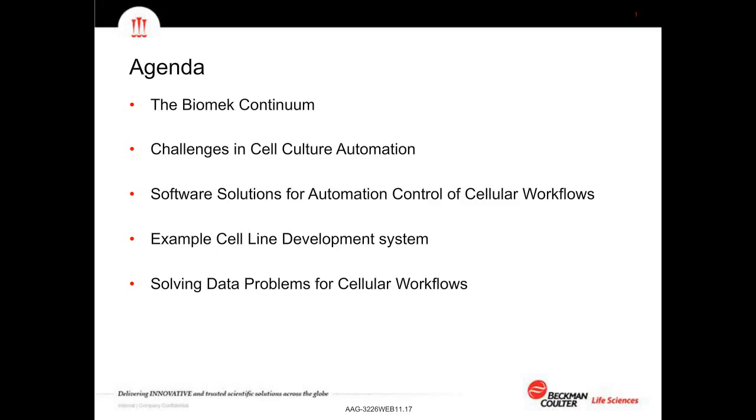And then I'll hand over to Tim, who will talk through how we would solve the data problems for cellular workflows. And hopefully you'll see as we go through this talk that many of the challenges we face are really software or data issues. Although once we have the hardware, we may have all the pieces on there, really how we control them and how we handle that data is how we solve a lot of these problems specific to cell culture.